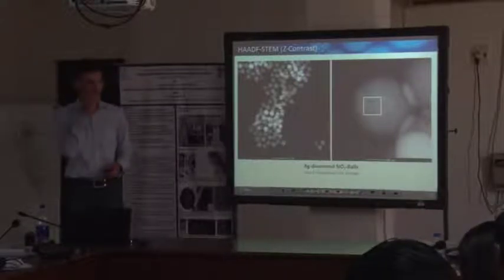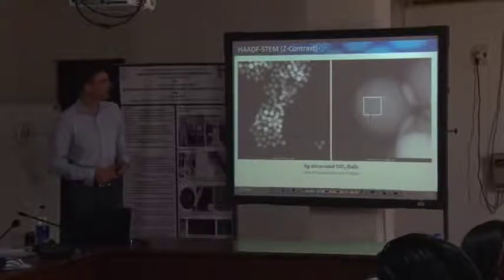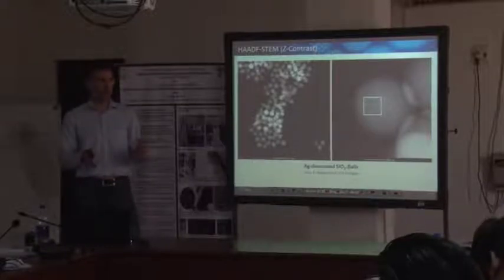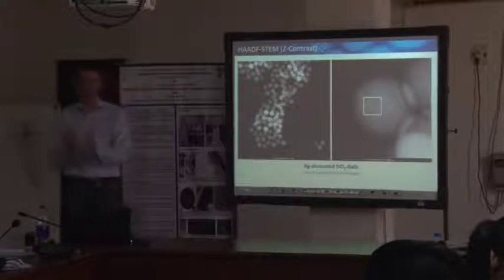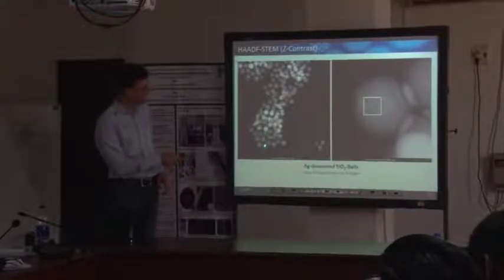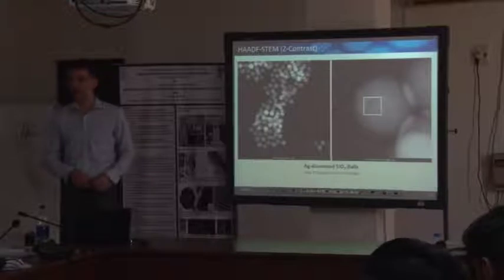We did some analysis of biological specimens like photonic crystals of butterfly wing scales, and it's far easier because in conventional TEM you always end up with Fresnel fringes, in particular for thick samples, and here you just focus your electron probe at a certain depth of your sample. And here are already pretty large decorated silica balls, of the order of a few hundred nanometers. But you can clearly see these decorating metal nanoparticles.